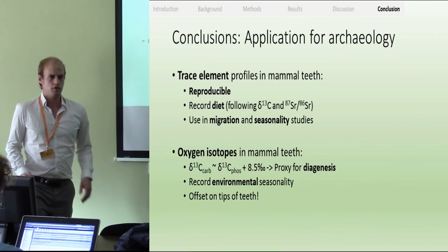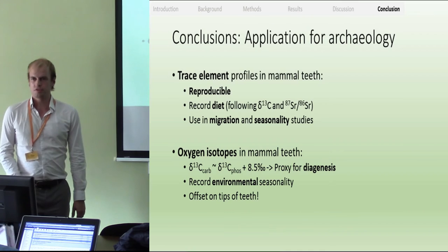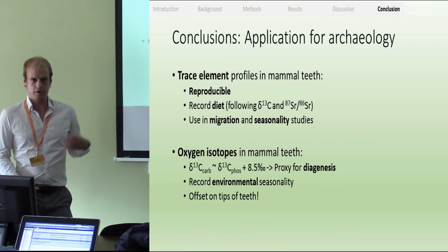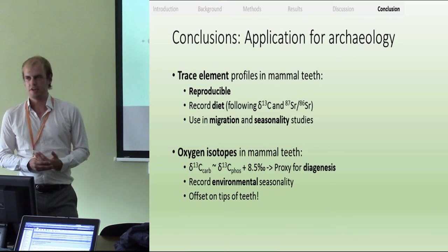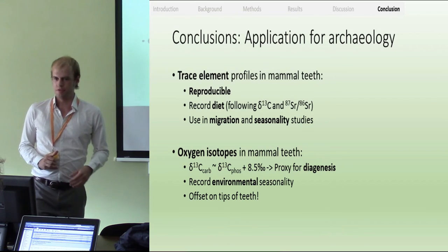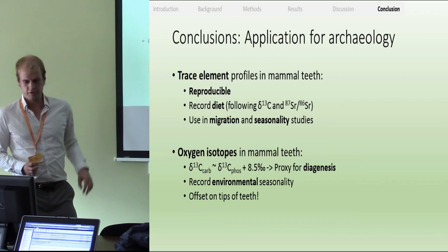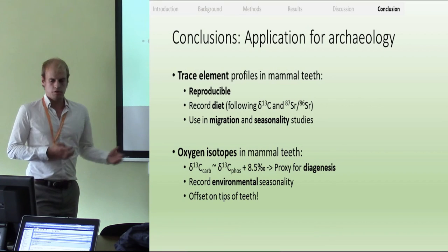Just to conclude, this is for a modern tool, of course. We can do reproducible trace element analysis in these modern mammal teeth. And the question now is, of course, can we do this on archaeological and even fossil, paleontological teeth too, to see if we can reconstruct diet in the past? It depends on whether the trace element is preserved or not in the tooth enamel. And these diets linked with the trace elements can possibly be used as a paleodietary proxy.